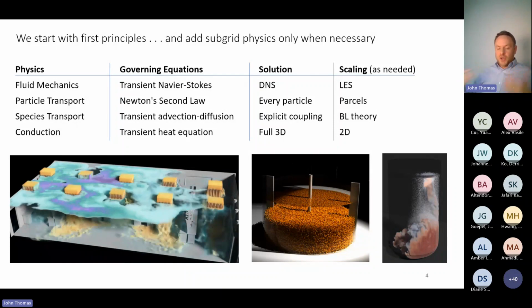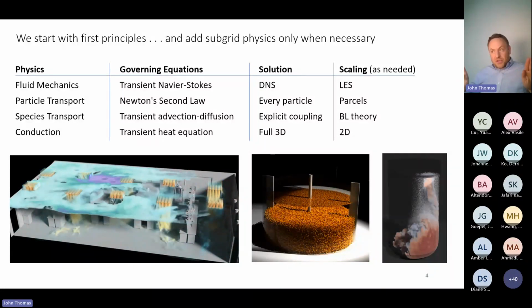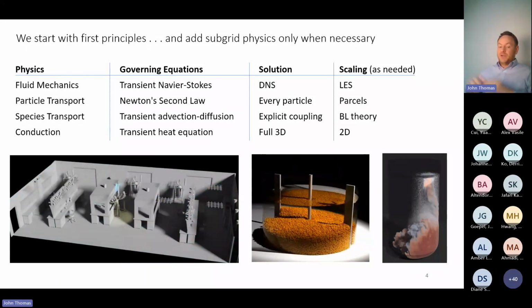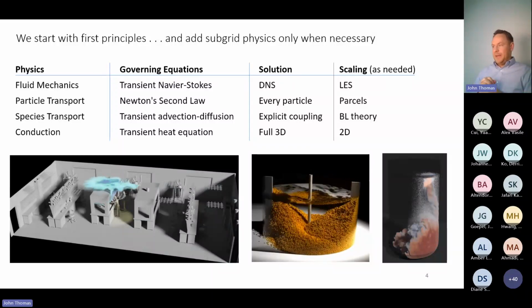We're actually watching the turbulent energy cascade evolve organically. If we have to lop off some of the smaller eddies using the LES model, we'll do that. But we're not going to start with some sort of mean flow field assumption and try to superimpose physics on top of that.